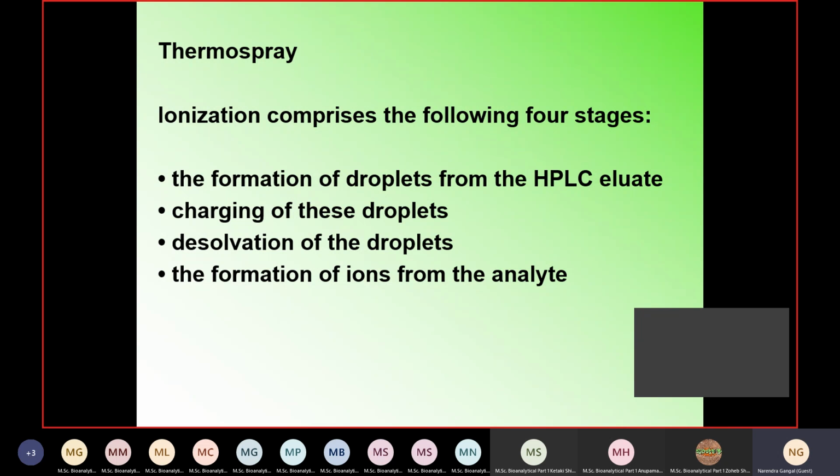Which are the typical solvents used in HPLC? Methanol is one. What is second? Very typical, minimum three or four solvents you must tell. One is methanol. Second, water.